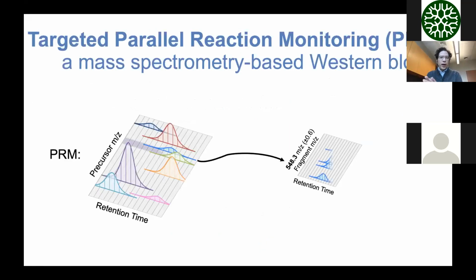Okay, so I first want to talk about data acquisition before we get into how we interpret this type of data. And I think the way I like to think of DIA is actually like a targeted experiment.